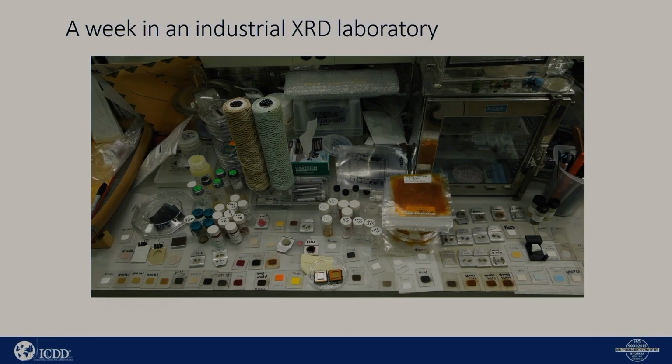Something would come into the laboratory, and we heard the excellent presentation just a few minutes ago about identifying phases. What's there? And even if you could identify the phase, why did it not work? So getting into microstructure analysis. So this is what the involvement was and where I gained my primary experience in X-ray diffraction, X-ray crystallography.